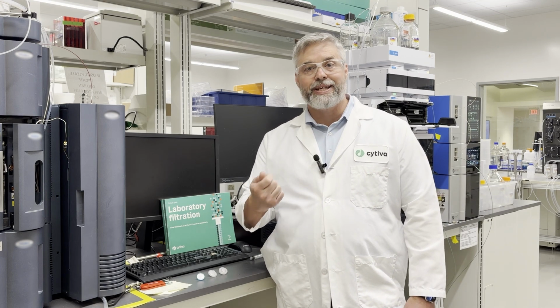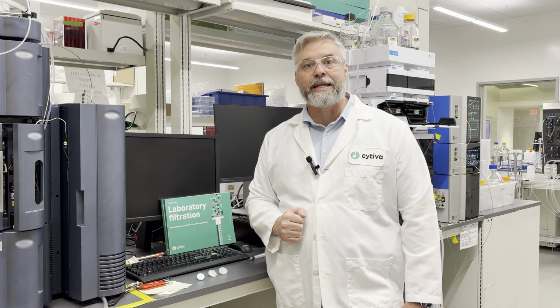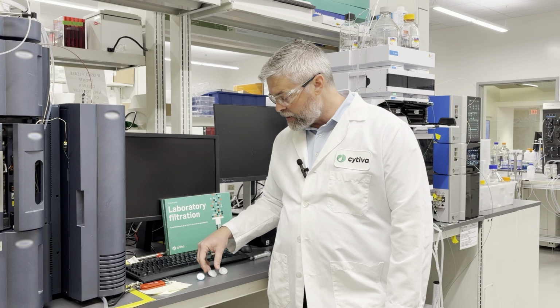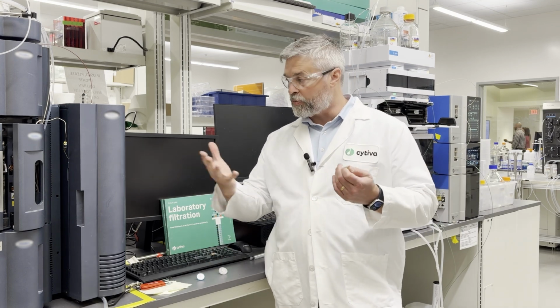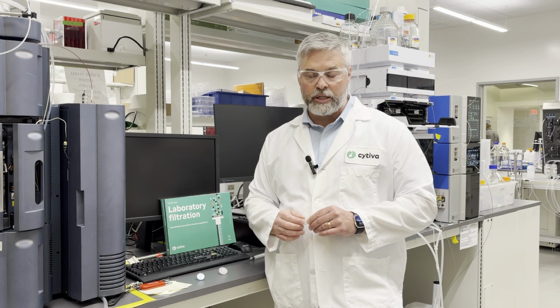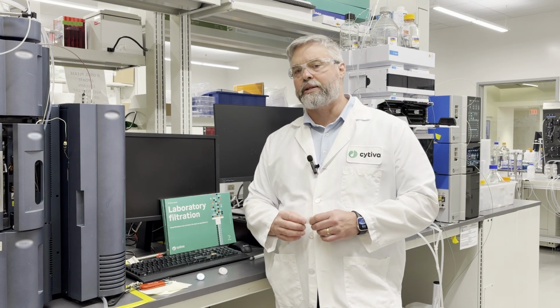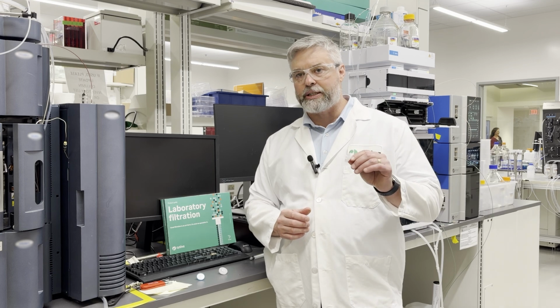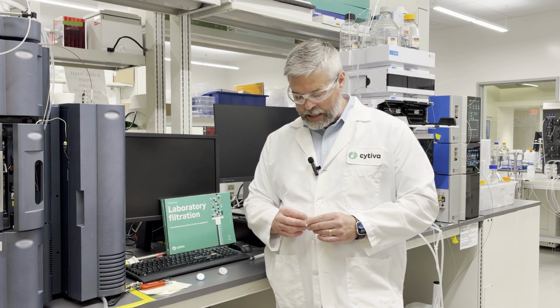So if you need to test any samples for PFAS contamination or to check the level of PFAS in any sample, we do recommend that you should be using a syringe filter for that sample analysis or prior to injecting into an HPLC for several reasons. One, column protection. You always want to protect the column that you're running on, and taking particulates out by a syringe filter is the easiest, best, and fastest way to do it.